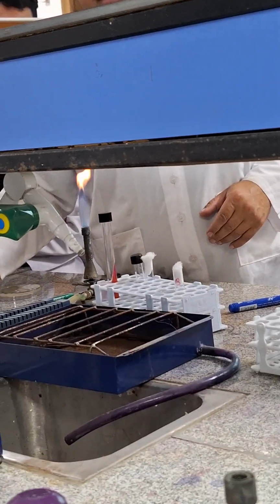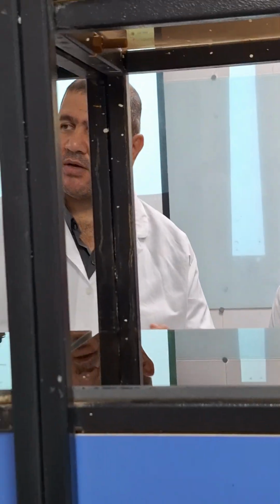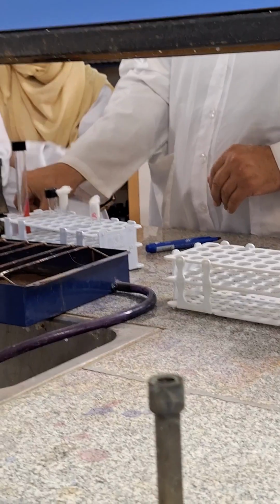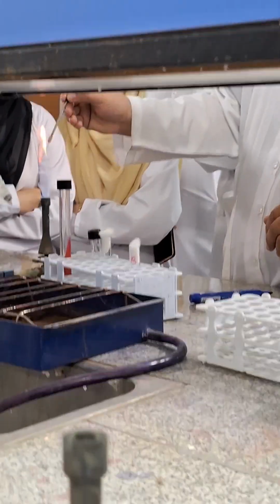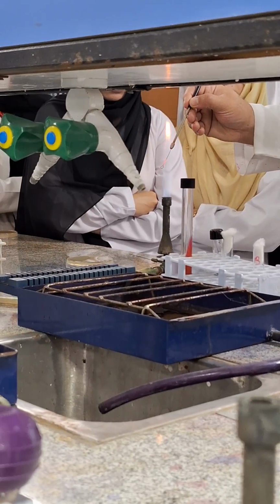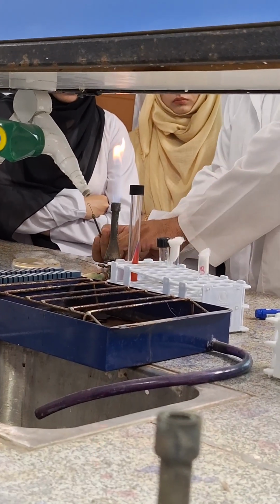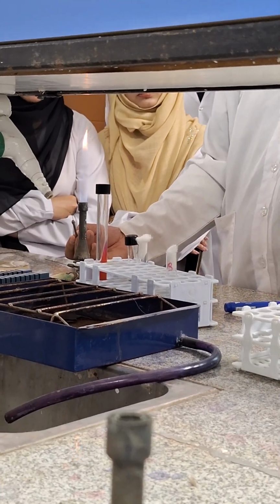Place your plate near the flame. Open the plate that contains bacteria. According to your lab ID, for example, number 1, number 2, number 3, you must choose your unknown bacteria. First, sterilize your loop. After that, near the flame, open the plate that contains bacteria.